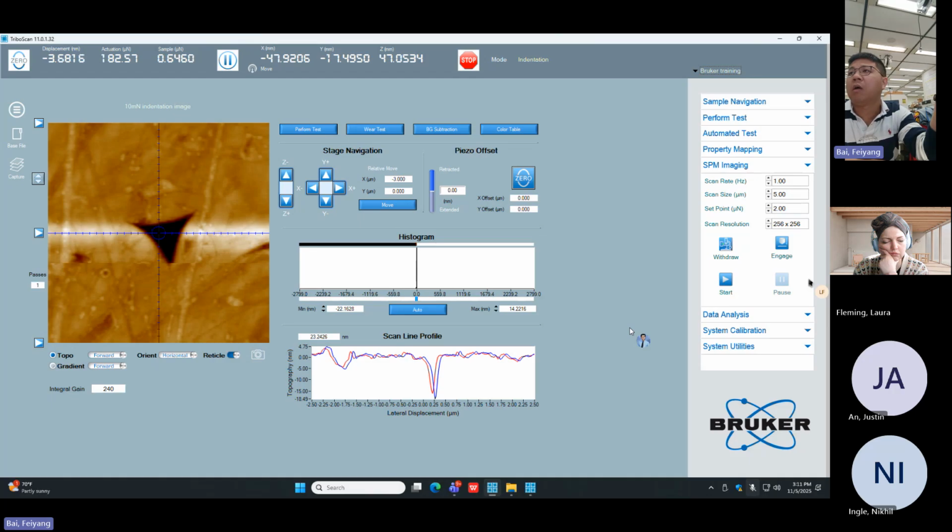Before we coat, I measure the roughness or image it, and then we coat, and then we image again the same area, and hopefully that can give us the difference, which will be the thickness that we coat. Is that feasible? If we can find a spot, first of all. Right.